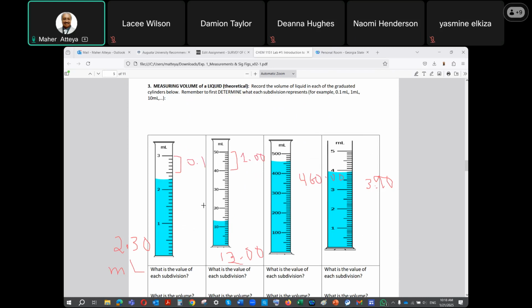How about here? 10 milliliters. Correct. How about here? 0.1 milliliter. So this data here, you fill those in here.